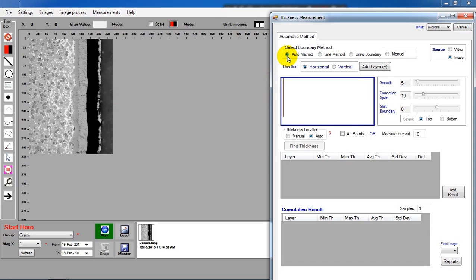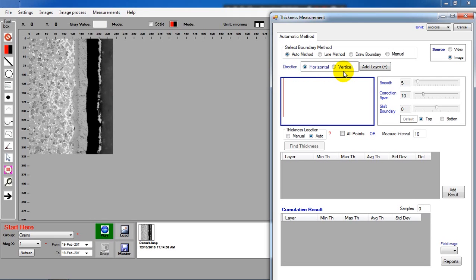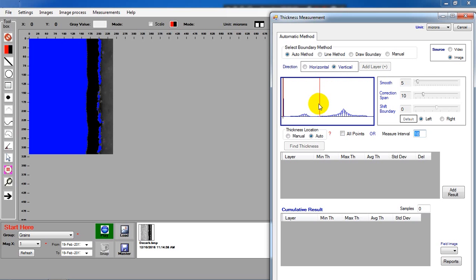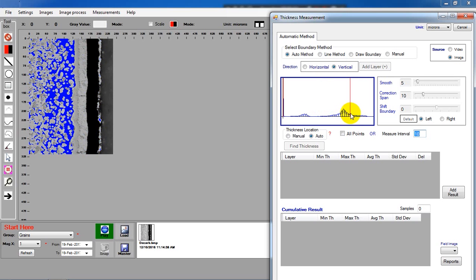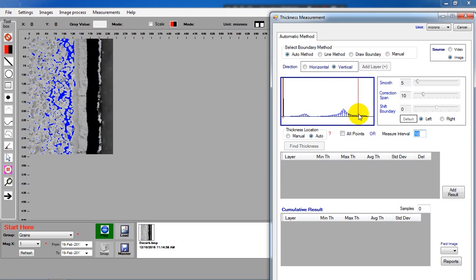Choosing right coating direction is very important, otherwise the software will return wrong result. Adjust the threshold to isolate the coating area.